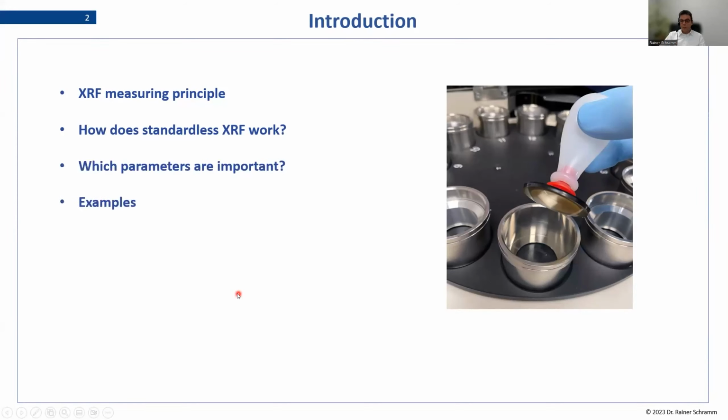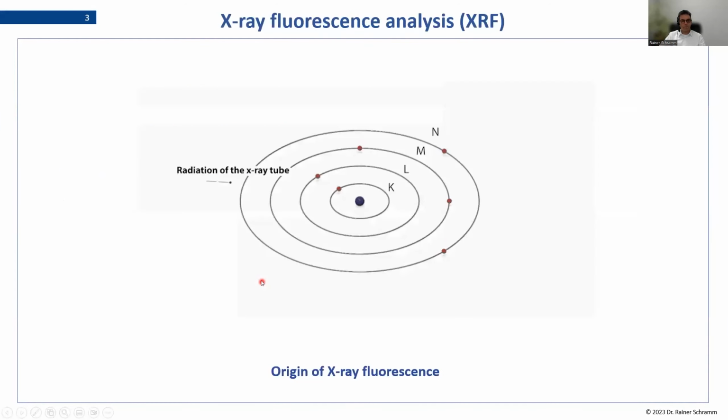And last but not least, I will give you a few examples to show how the parameters you input into the software will influence the final results, and where you have to be careful and take care. Okay, let's talk about some basics.